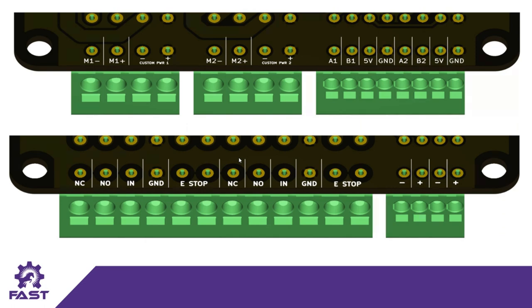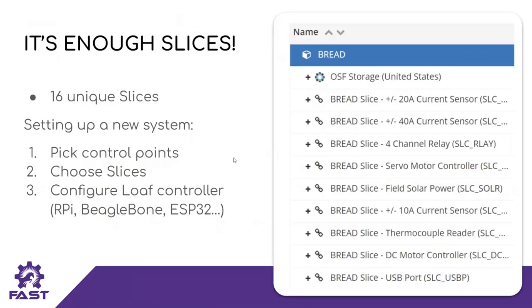On all the slices, the inputs and outputs are labeled. Rather than using screw terminals, I went with a press-fit design — you just plug in a solid core wire, and if you want to unplug it, you put a little screwdriver in the notch at the bottom and pull the wire out. On our Open Science Framework repository, we have 16 unique slices to perform various functions. Setting up a new BREAD system is as simple as picking your control points, going to the repository, picking the slices that meet those parameters, and then configuring your controller — whether a Raspberry Pi, a BeagleBone, or an ESP32. Really anything I2C-enabled could be used to control these slices.